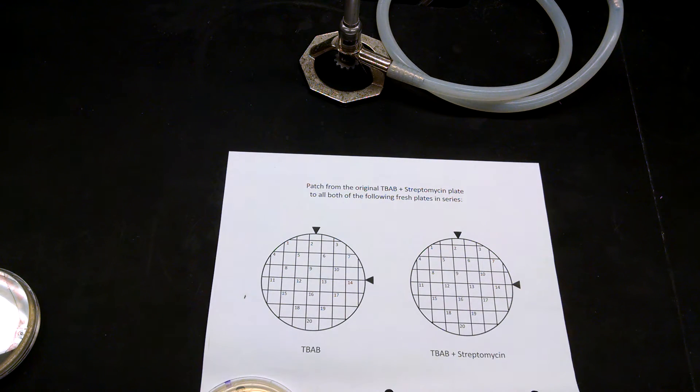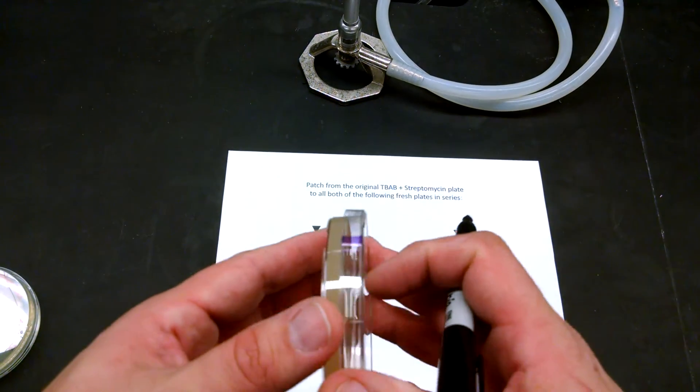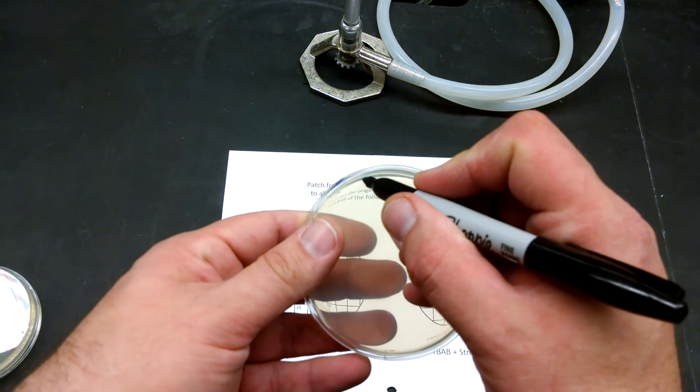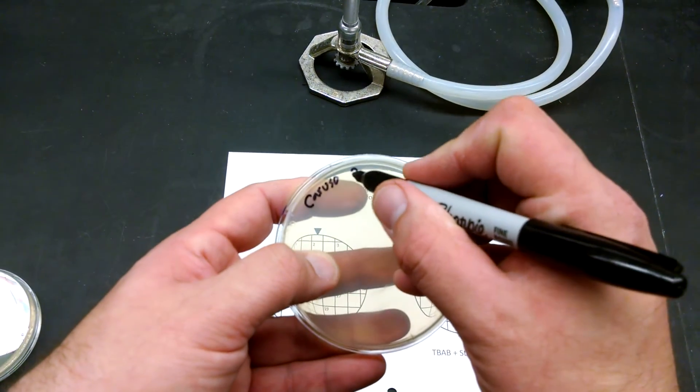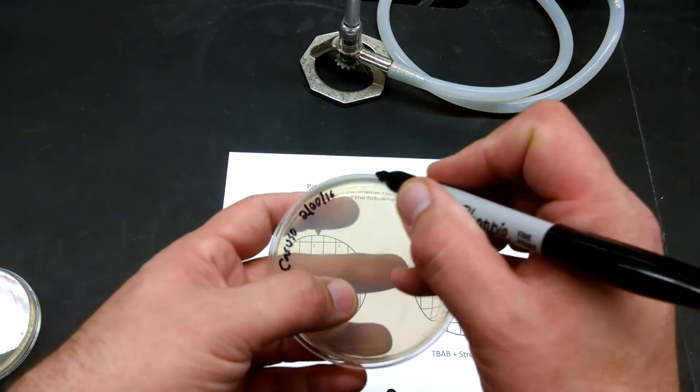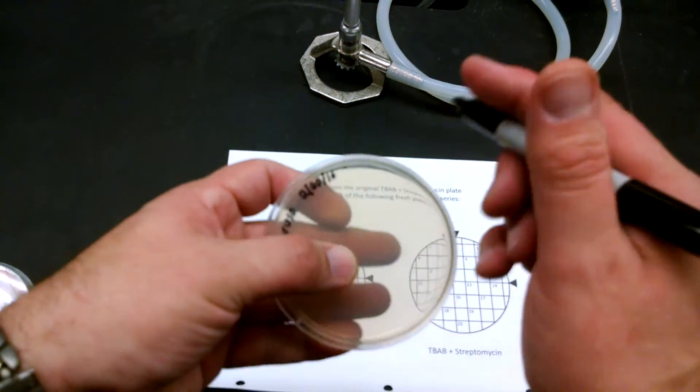Make sure you label them, because remember the way we've identified these is on the lid. Once you take the lid off, you can't tell what's what. So we're going to go ahead and label these. Remember to include your name, the date, and the condition. This one is TBAB.